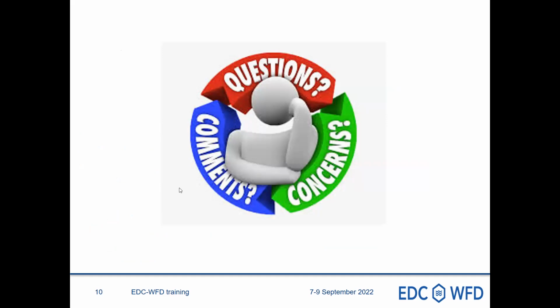Hi, this is Sebastian Buchinger, Federal Institute of Hydrology. It's more of a practical question. Perhaps we come back later to this when we talk about the trial. My question would be, you have put some effort into defining these reference materials. So at the moment we just buy a vial of EE2 from Sigma or something like this, but this would not be a traceable reference material as you define it. Could we get access to such a traceable reference material for the trial from you, or where do we get it?